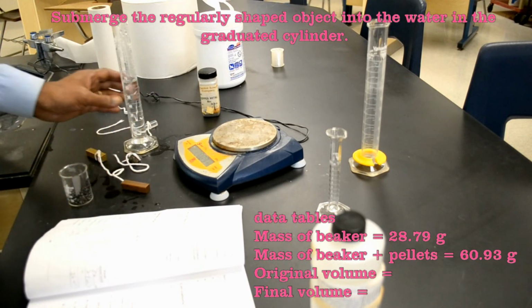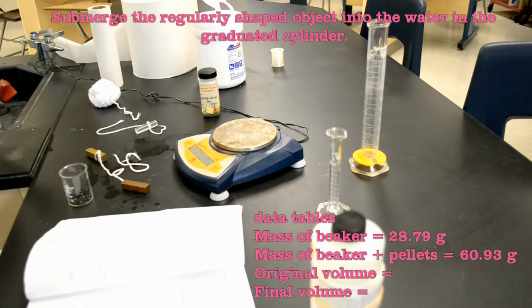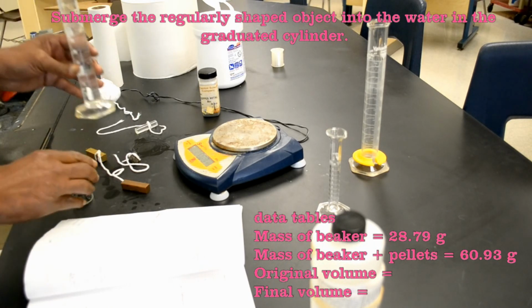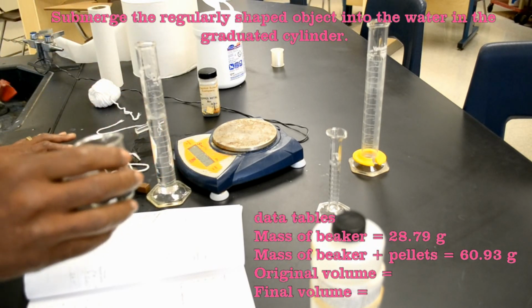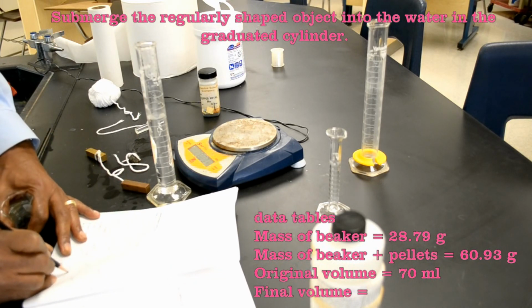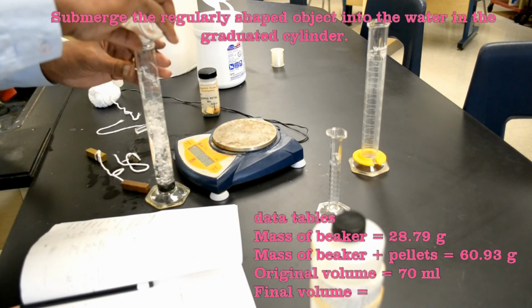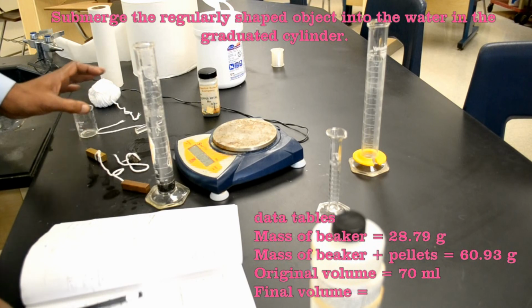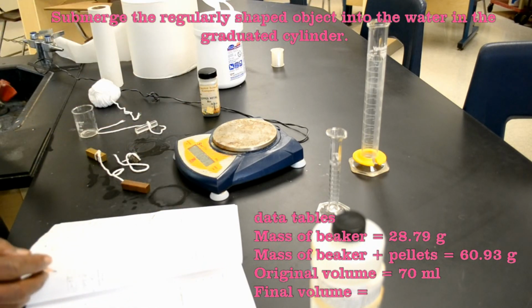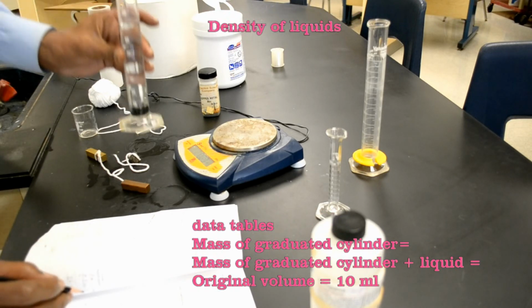Now I have to add the pellets to the graduated cylinder. The original water level is about 70 mLs, and I'm going to add the pellets. The volume goes up to 75.